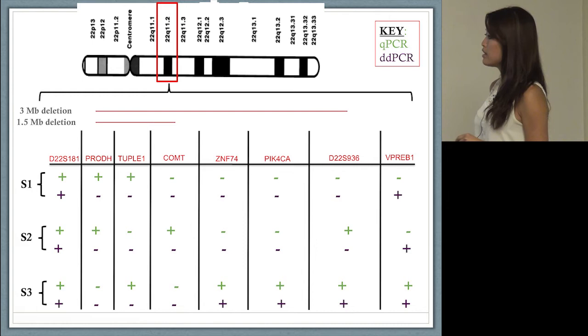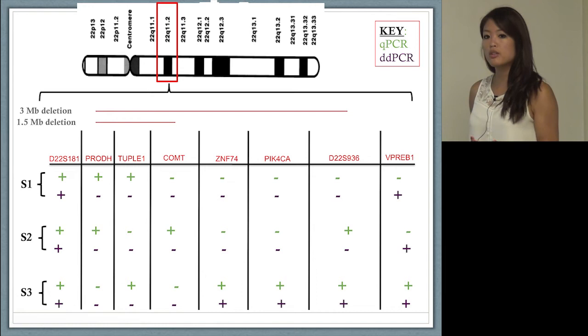For sample three, it looks like this individual has a 1.5 megabase deleted region, but it's hard to say where the endpoints are. You can tell that the DDPCR results are pretty straight across the board, and I'll show you the numbers later. They look way more reliable and robust.